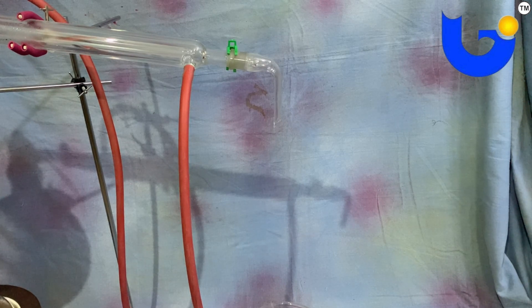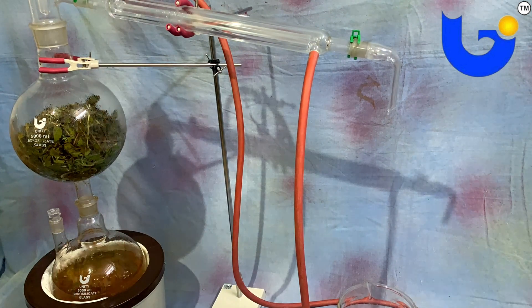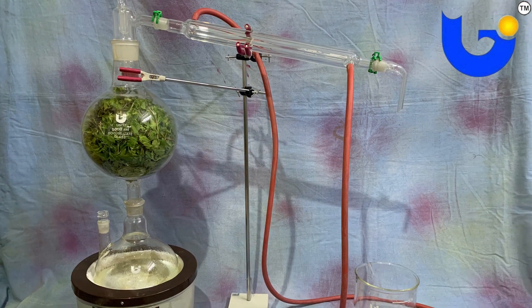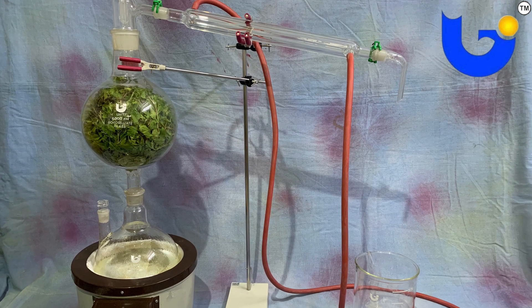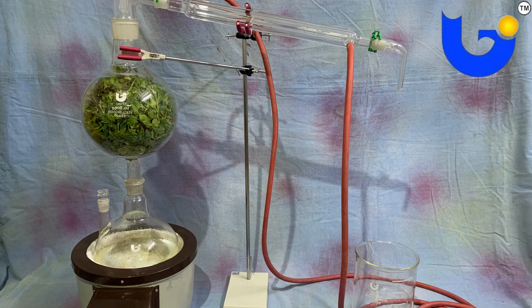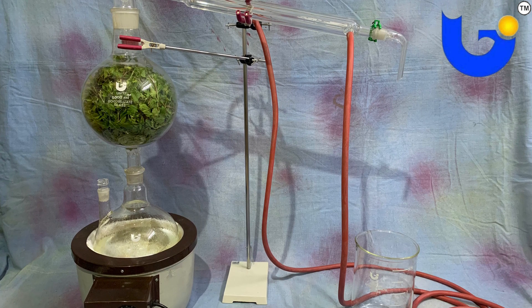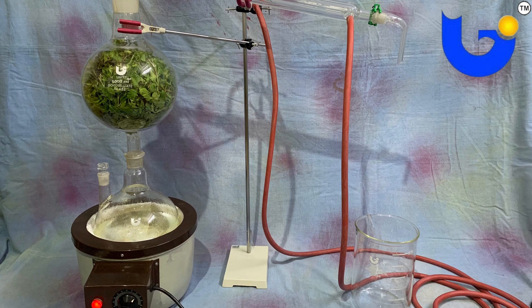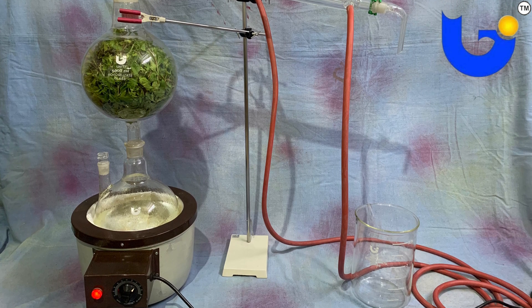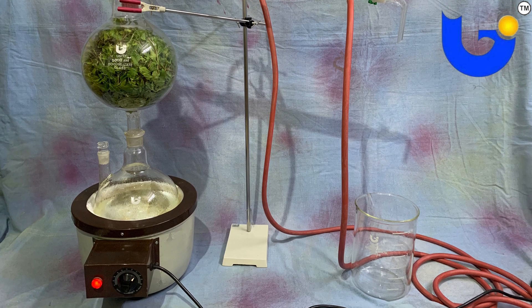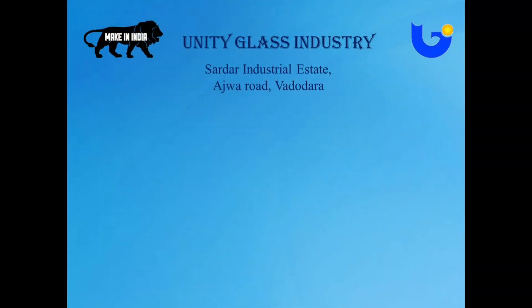As you have seen in the video, our designed units are easy to install, easy to operate, easy to maintain. You can get your compact essential oil distillation unit at your doorsteps in all over India at very reasonable price. We are ready with spares and extra components for your service. You can order your essential oil distillation unit on below given contact details.